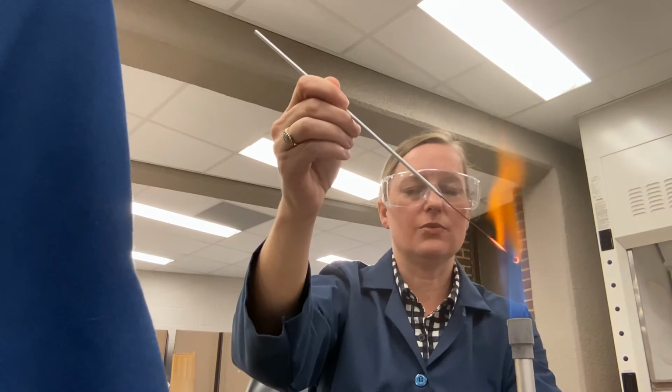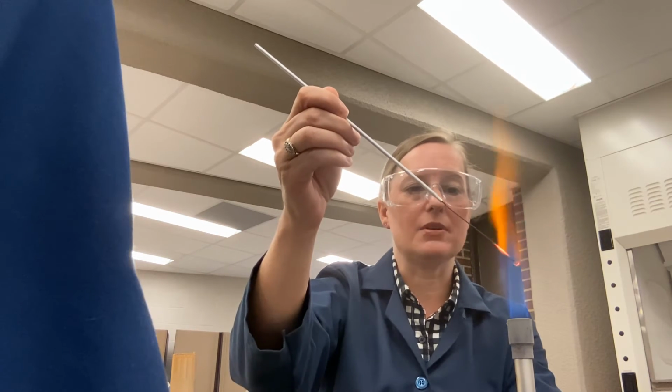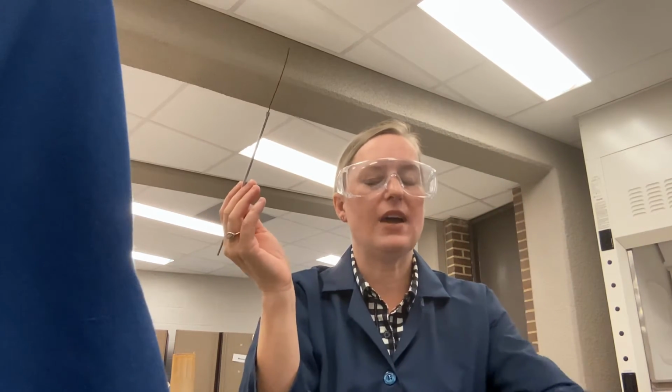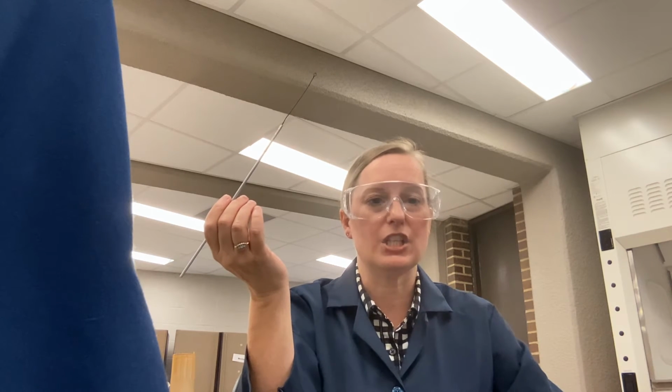Get it all nice and red hot. Students often ask, how long do I flame the loop? Honestly, there's not an exact number. It is when it gets nice and red hot. I also get the question of how long do I wait for it to cool? You just have to be patient. Whenever you think that it's cool is when you would go to the next zone.